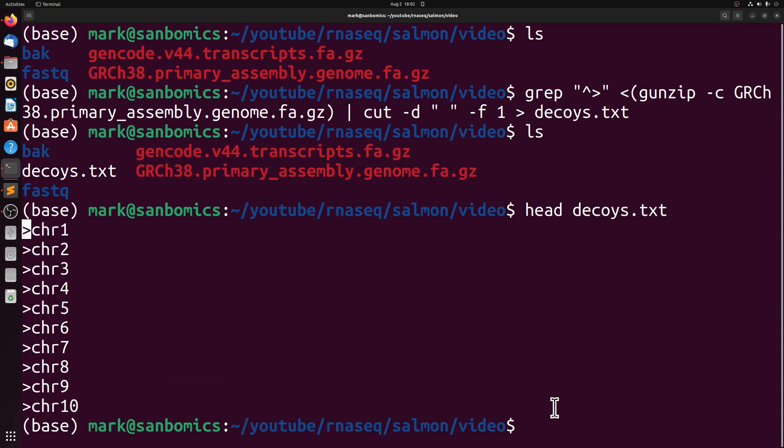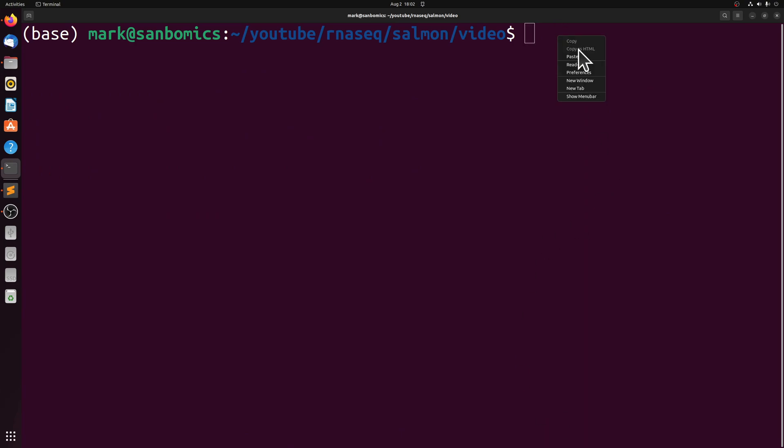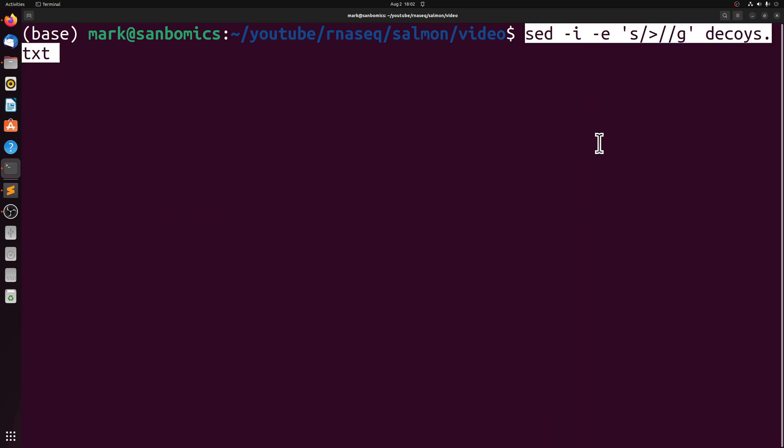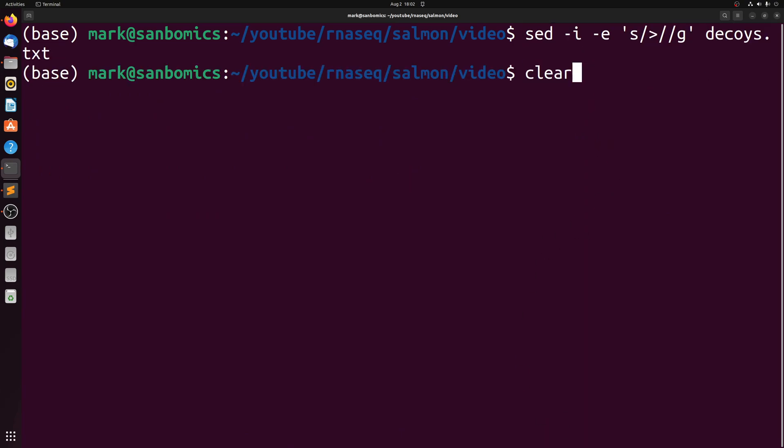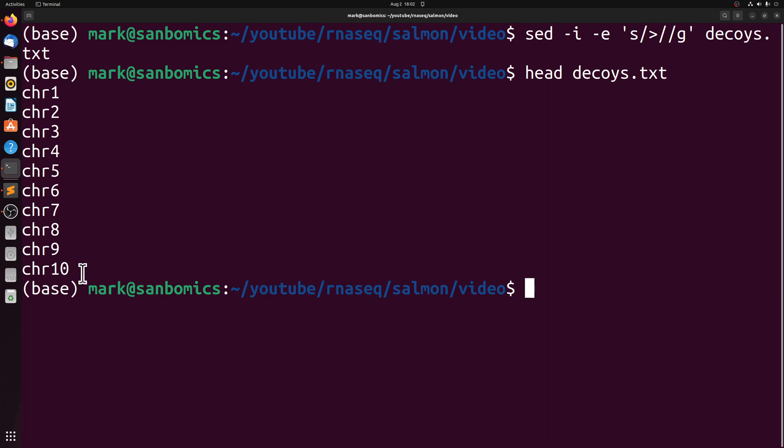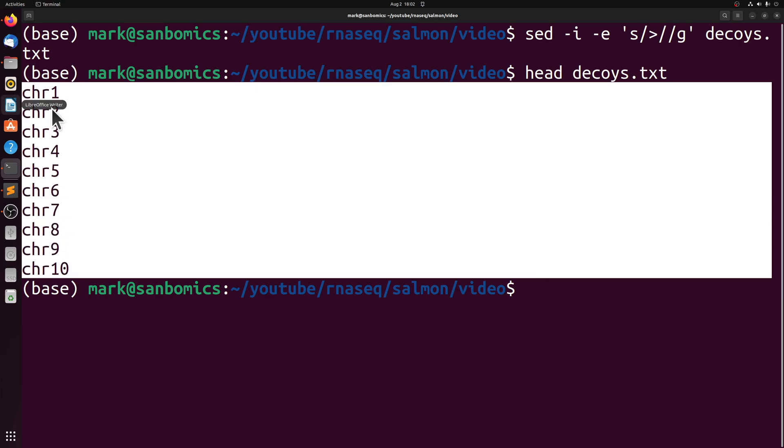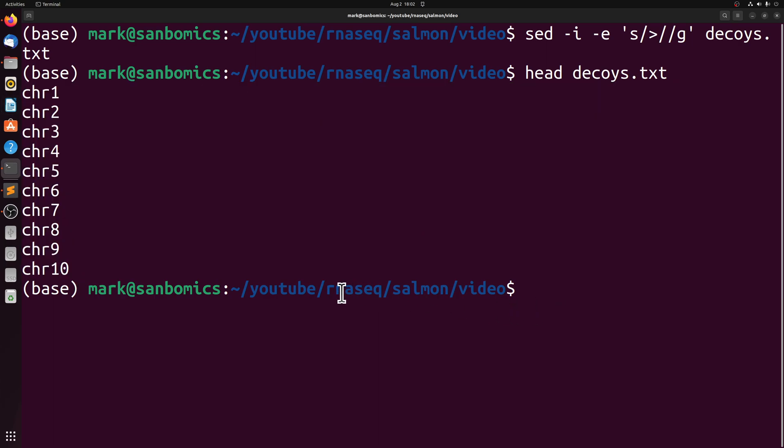So we're going to use sed to do this. You could easily just Ctrl-Find-Replace in any text editor. So if we look at it now, we just have the same thing with the caret removed. And so the decoys.txt is now ready.